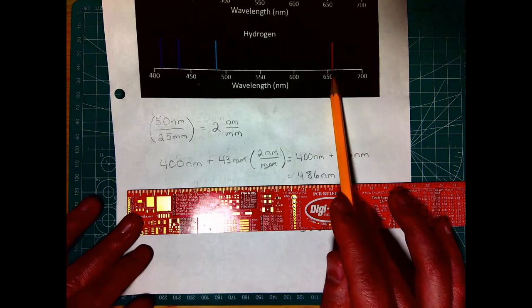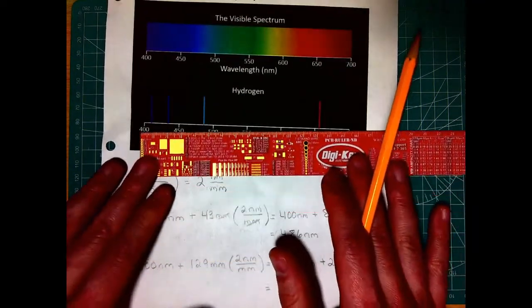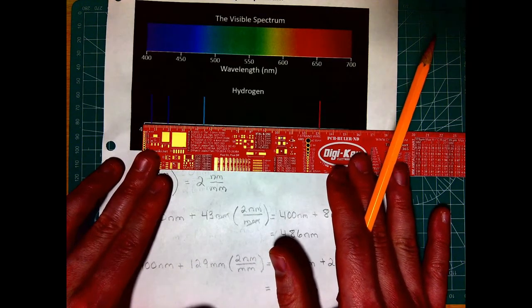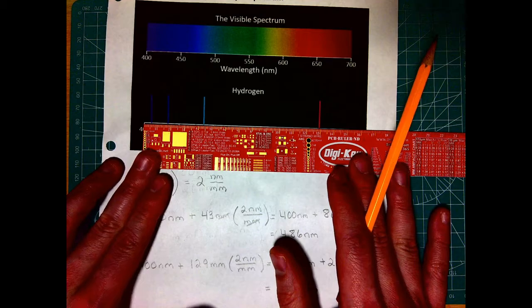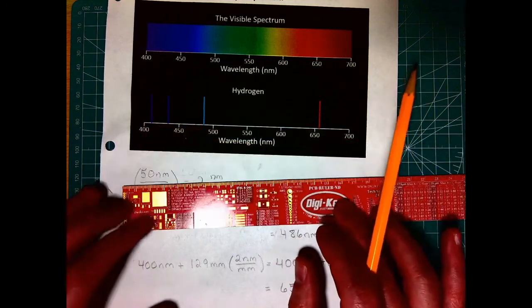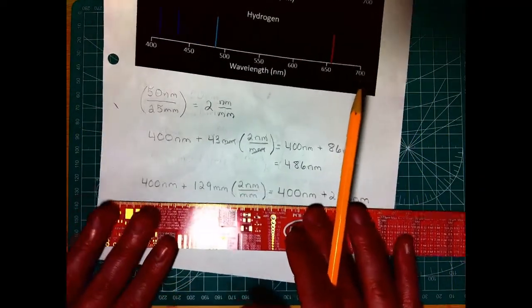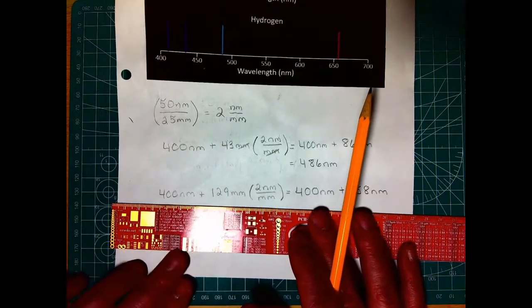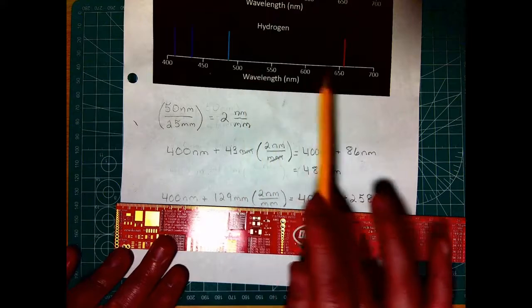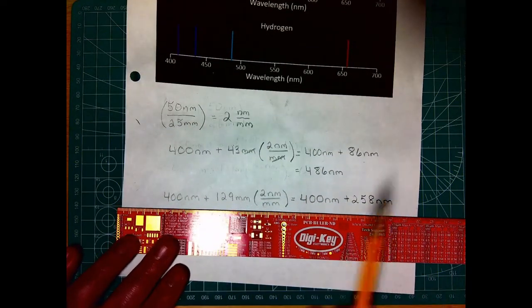If we wanted to do this far red line, we can put our ruler down on it, and I'm going to say that that's just about 129 millimeters. I can do the exact same thing here: 400 nanometers plus that 129 millimeters, at 2 nanometers for every millimeter.